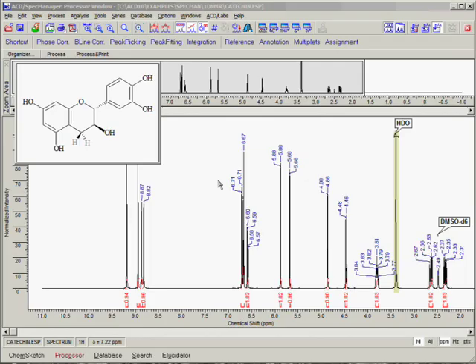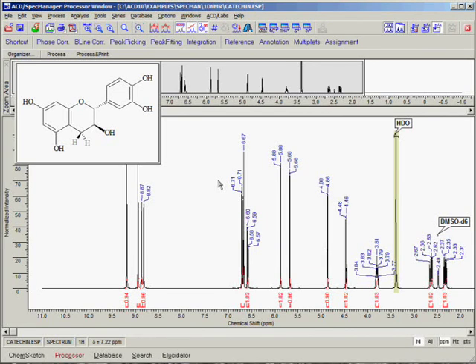We will begin with a proton experimental spectrum. As you can see, many processing steps have already been performed on this spectrum. We have already Fourier transformed the data, peak-picked the spectrum, referenced to DMSO, and integrated and attached the chemical structure.